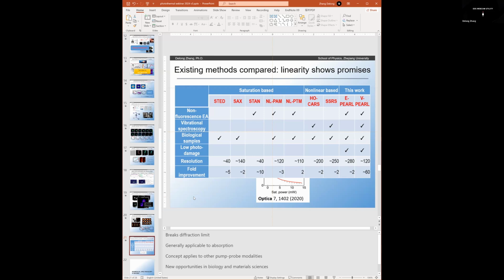But can you give us some idea of the limit? What is the brightest signal you get, and what is then the smallest structure that you can reach with your technique and equipment? Typically, is that what is on this graph? In tens of nanometers. Okay, so you are sub-wavelength, right? Yes, sub-wavelength optically, of course.